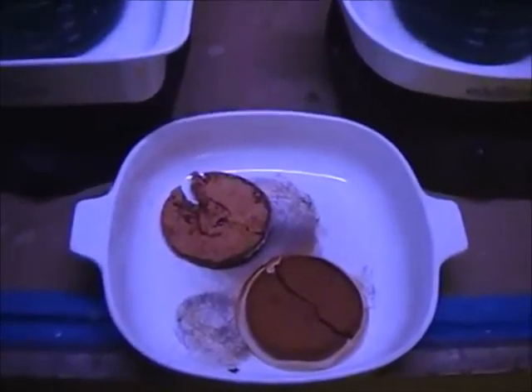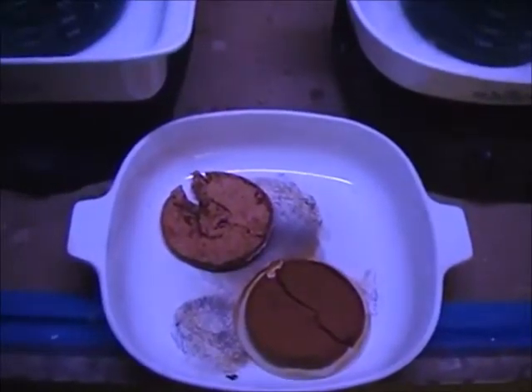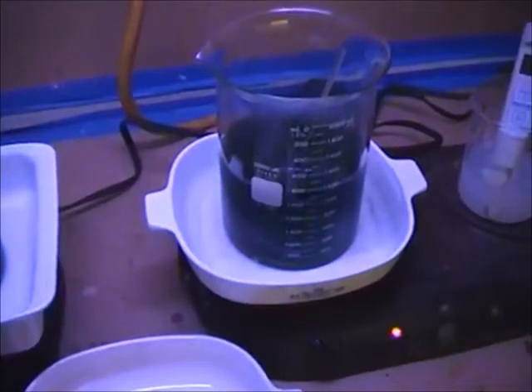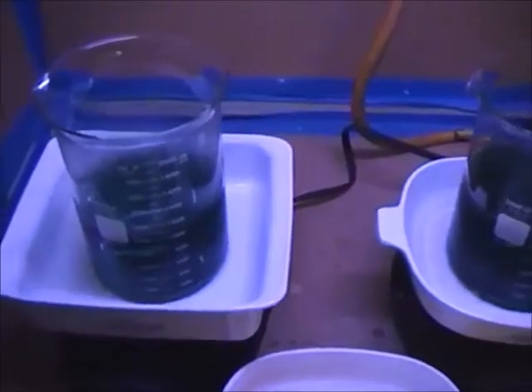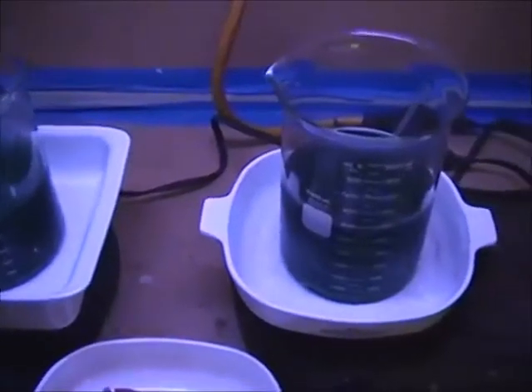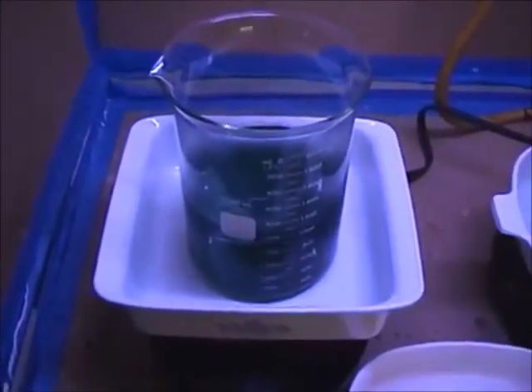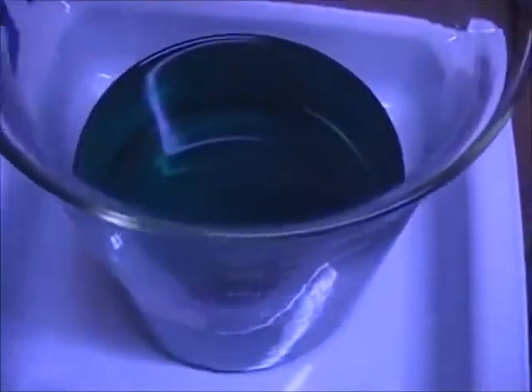After I let it sit overnight and filtered it again to remove any more sediment that may have been in there, it was still kind of cloudy. But once I placed it on the hot plates and started bringing the temperature up, because we want our temperature to be 140 degrees for this step whenever we precipitate it, I noticed that the clarity of the solution started to get better. Then I added about 10 milliliters of nitric to each solution, and those hydroxides went back into solution, and these solutions are now crystal clear.